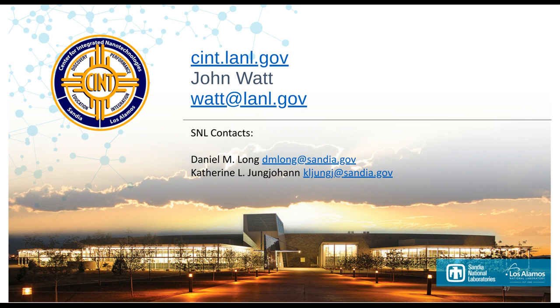Thank you, John. Our next question is for Daniel again. How long does it take to prepare a FIB lamella of a vitrified liquid-solid interface and also a polymer soft material?